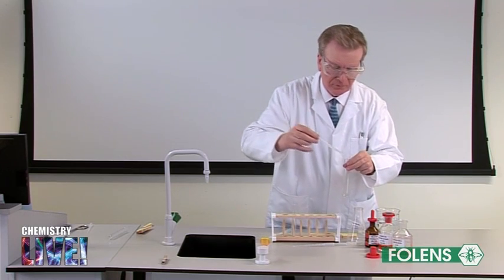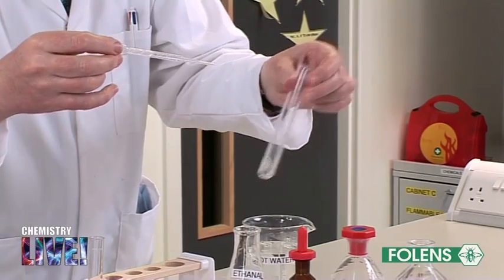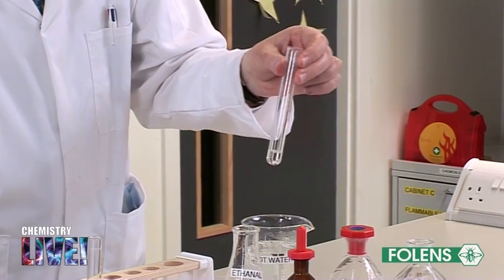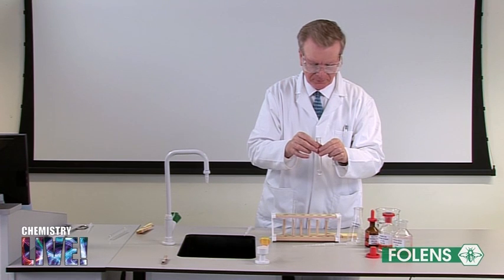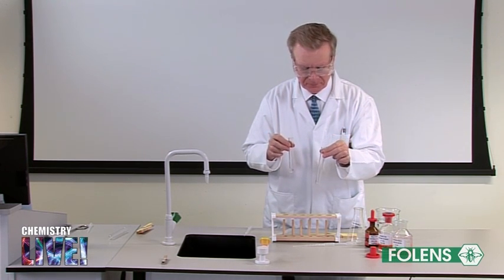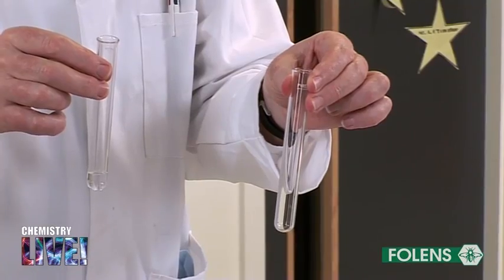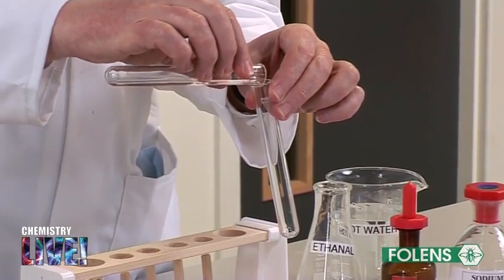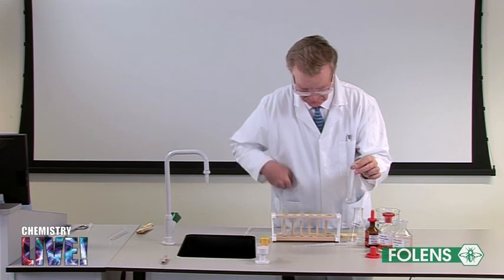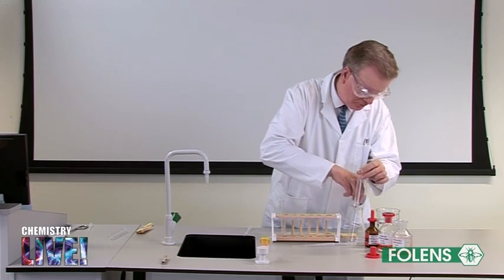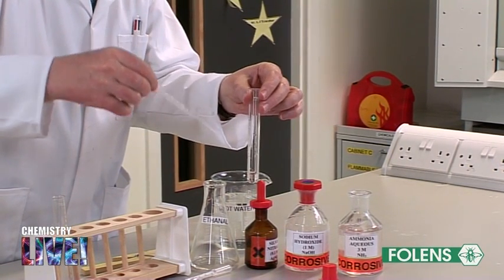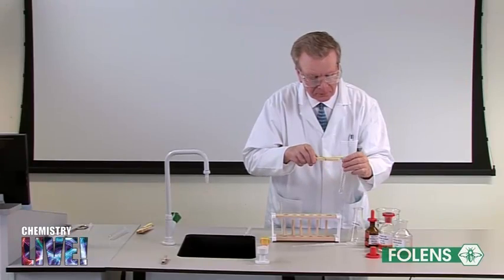You have now prepared Tollens reagent. Tollens reagent must always be freshly made up. If stored, it is likely that explosive products will be formed. Take another dry test tube that has been washed out thoroughly with detergent, rinsed with ordinary water and finally with propanone to remove any droplets of water. Pour the Tollens reagent into the clean test tube. Add about 3 drops of ethanal and using a test tube holder stand the test tube in a beaker of boiling water for a few minutes.